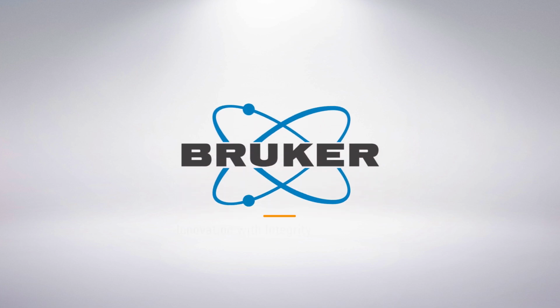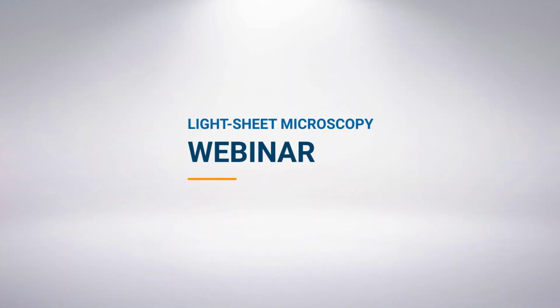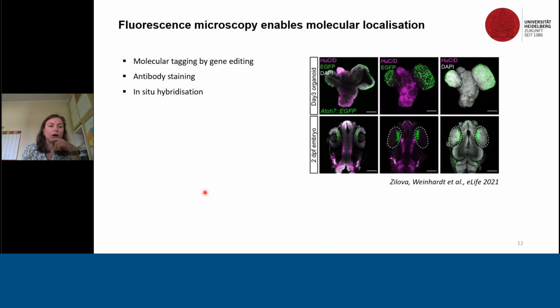This type of analysis in biology is typically done by fluorescence microscopy, which is, I would say, a workhorse right now in many laboratories. And it's done because it is possible to tag a gene by molecular targeting, by attaching the GFP protein or any other fluorescence protein to the gene.